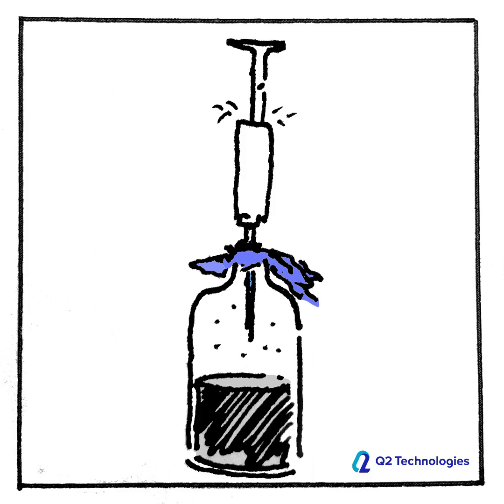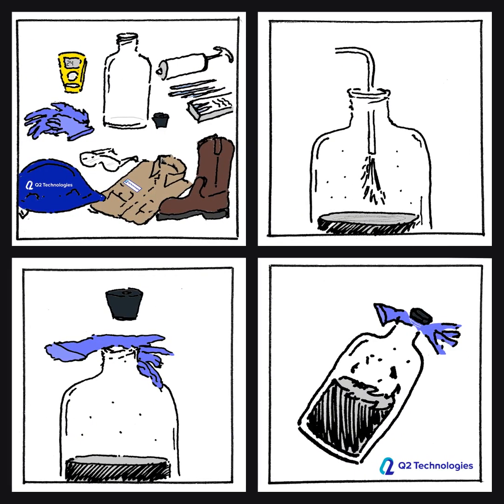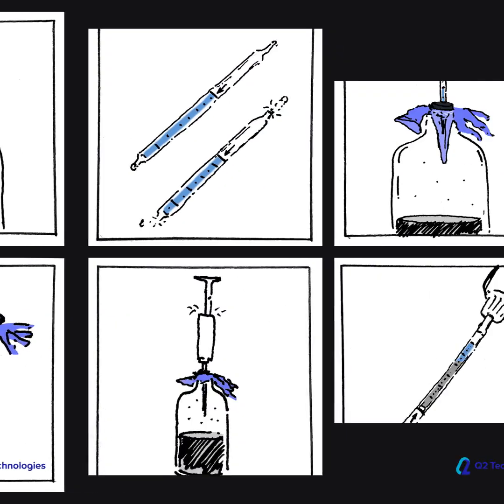One can remove the tube from the rubber stopper and the pump and take the final reading. Before taking the reading, we safely dispose of the crude sample in a designated disposal tank. In this example, one can see that the media has absorbed H2S to a point that would correspond to a specific PPM level. And there you have it — a way to sample crude oil while on location.